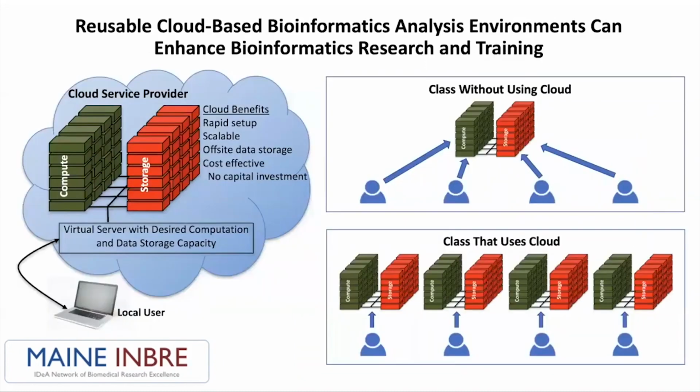To help students and researchers overcome these limitations, cloud computing technologies can be used. There are several commercial cloud-based service providers, such as Google with their Google Cloud Platform, Amazon Web Services, and also Microsoft Azure. These cloud service providers make it possible to essentially design your own computing environment, with a particular hardware architecture and storage capacity.